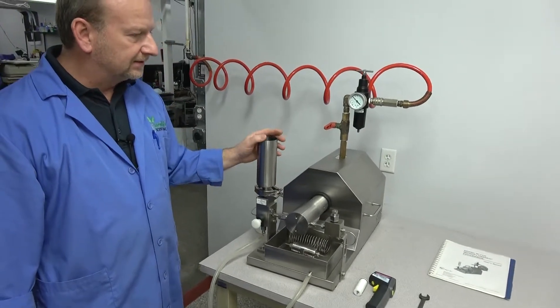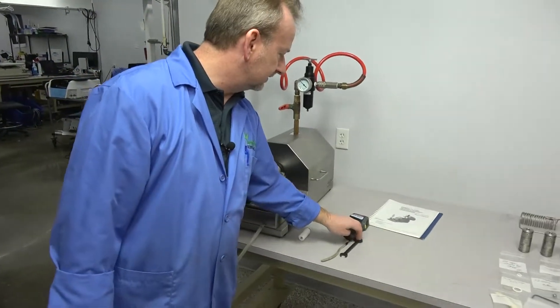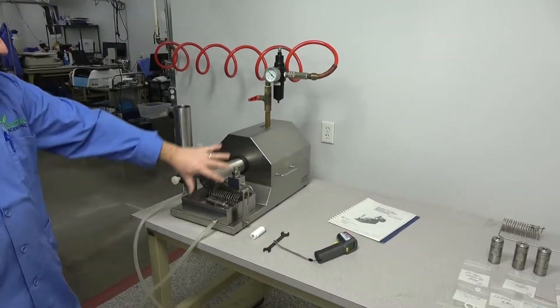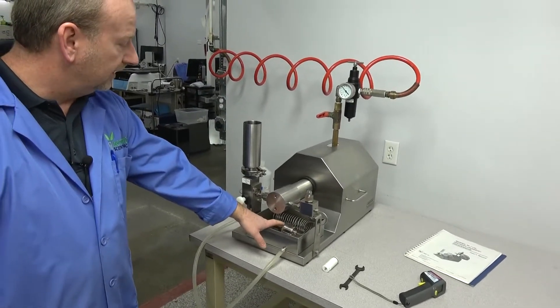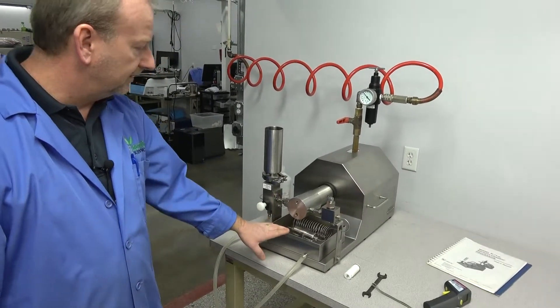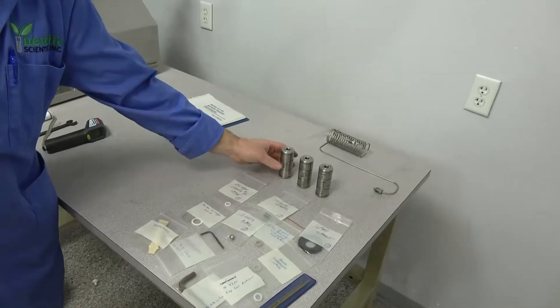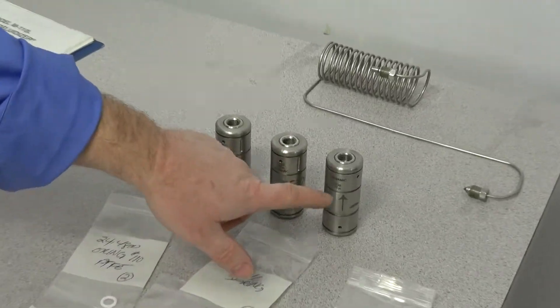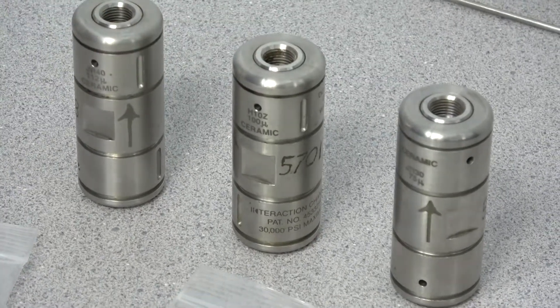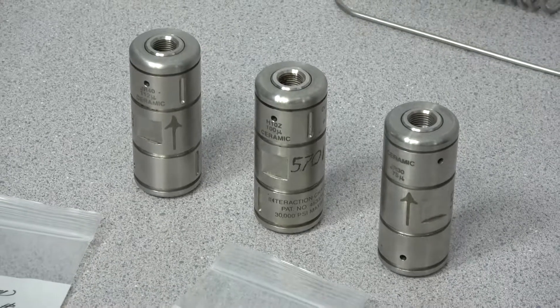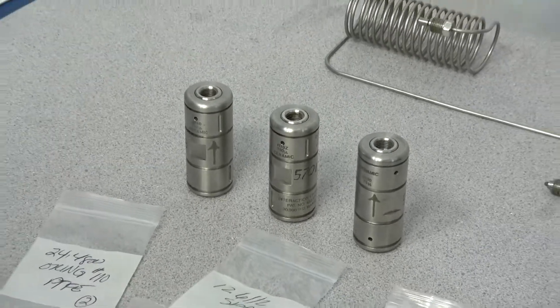I want to point out some other things we are selling separately over here. We did get some extra parts, but what you get with this system is everything you see here. We do right now have a 112 micron mixing chamber in here. We have some other ones over here we're selling separately. We have three different mixing chambers here. They're all ceramic, but the first one is 112 micron, we have a 100 micron and a 75 micron for some really fine mixing. We are selling these separately individually. Or if you are interested in this system and you don't want the 112 micron, you'd like to have the 75 or you might even want an extra one, just give us a call and we can work something out.